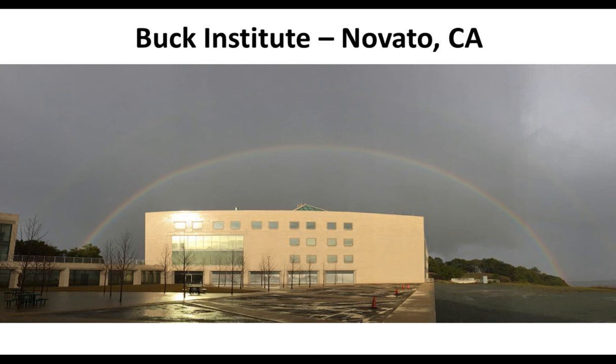That is also a very good question. What was very impressive for me as a user was to see the portfolio of phosphorylation enrichment antibodies that Matt showed earlier in his presentation, focusing on phosphorylation enrichments for different pathways, and the serine and threonine and tyrosine antibodies. So I do think that one could also combine these particular tools.